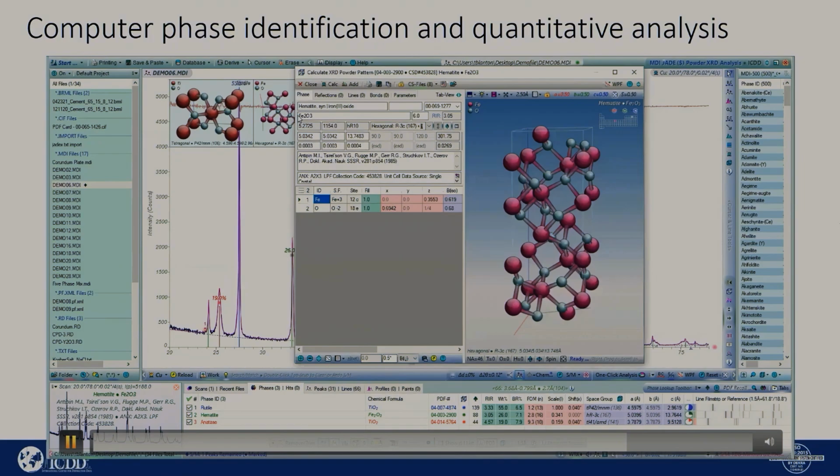Okay? Now, my question to this group, you have a new sample that comes into your laboratory, and you say, I'm going to do this one-click analysis. How many of you think you're going to get the right answer? Anyone? You're right. You probably won't. You can't do one of these, sort of hit a button, get an answer type test until you understand the system you're working with. You have to understand the system. So luckily, they still need people to do that.